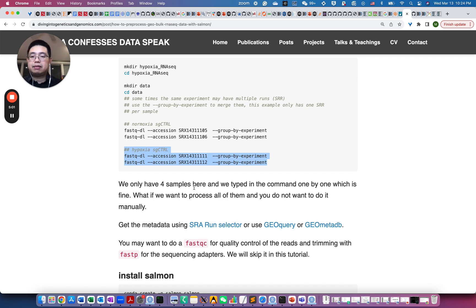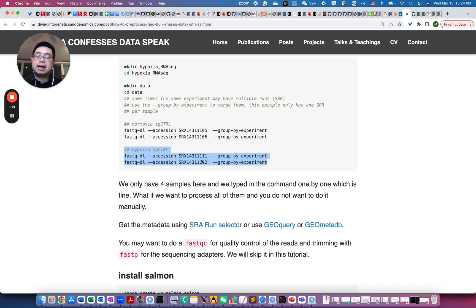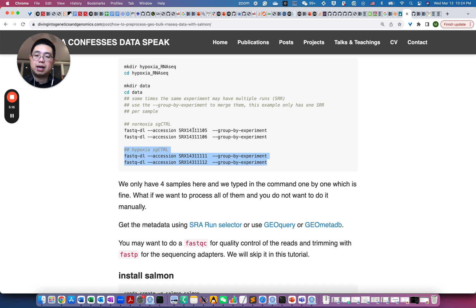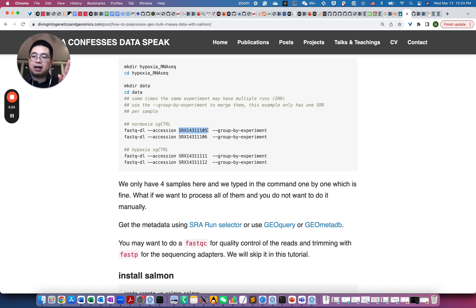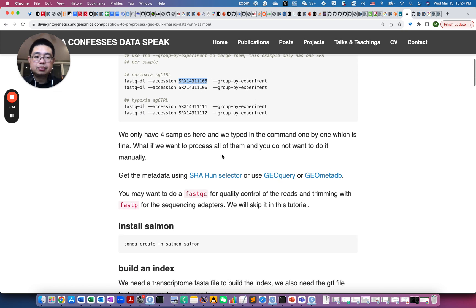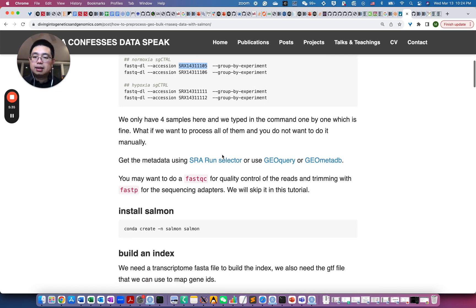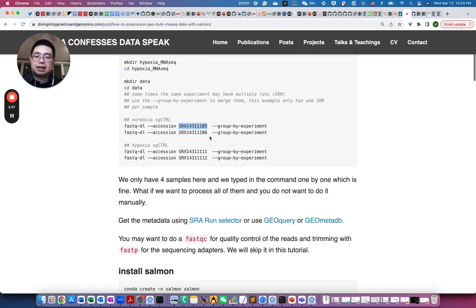So after you execute those commands, then there will be FASTQ.gz files downloaded into the folder. And because this is a single end, so you only have one FASTQ file for one sample. So if it's a paired end, you will have this SRX number, and then underscore R1.FASTQ.gz or R2.FASTQ.gz. So those are the forward and reverse reads. Just a quick note.